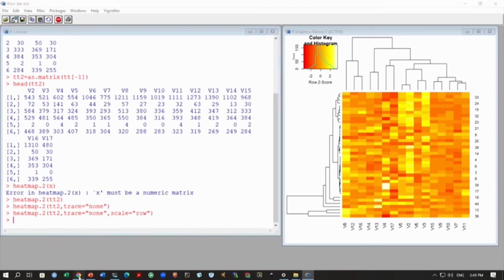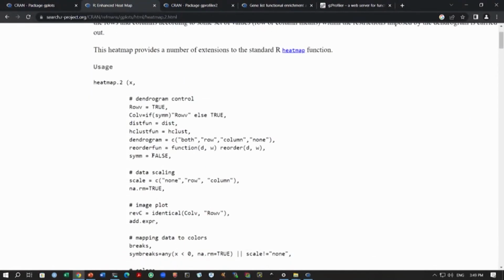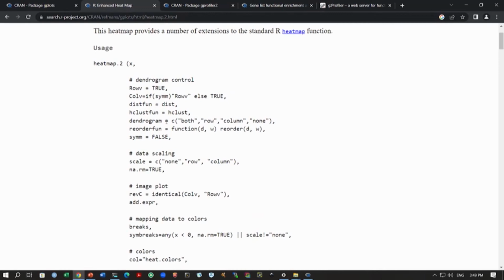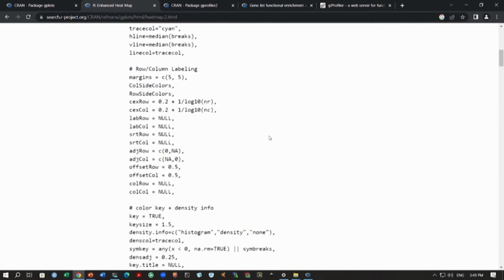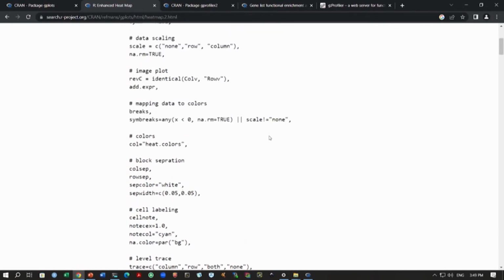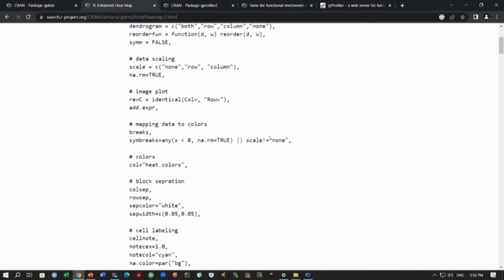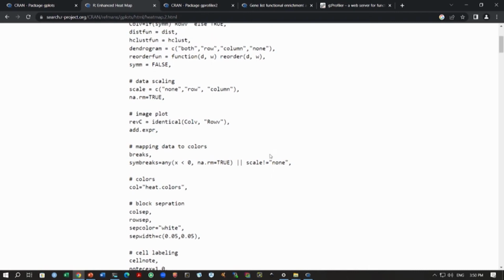One of the last things I want to do is switch off the clustering for the samples, because as I said we do not want this. So, we can actually switch this off using this cluster option. The dendrogram we do not want, I think, and then we can also switch off the clustering somewhere here, we have to look at again. There would be an option to switch off this clustering, so that you do not get this reordering of the samples. Maybe I am not able to find this right now, but you have this option where you can do this for your samples.